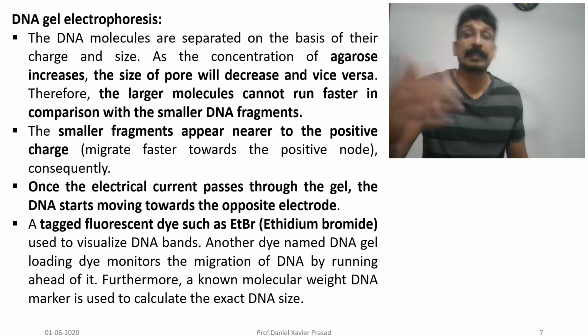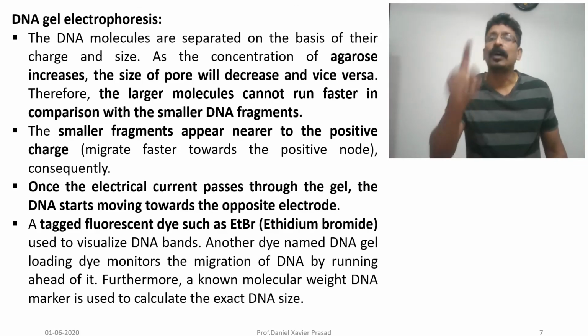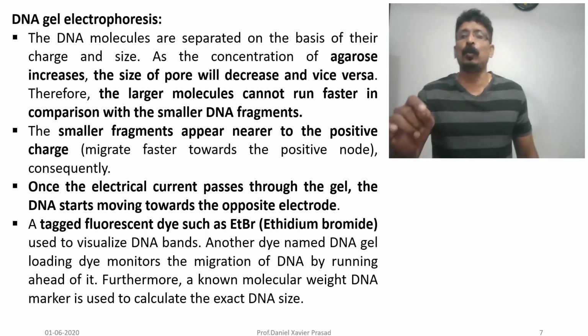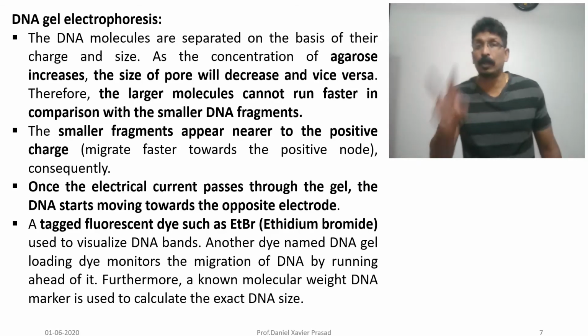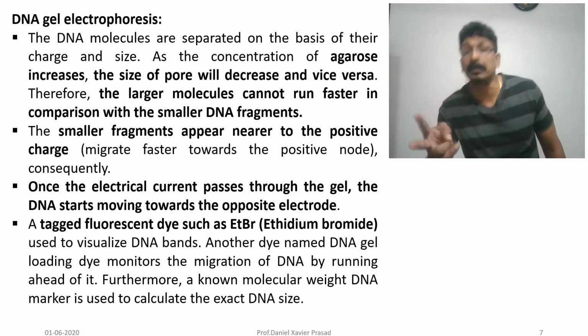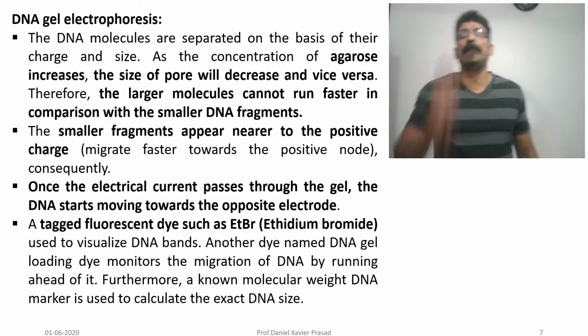But in my video, I have shown the electrophoresis, how two DNA samples are compared, whether they are similar or there is any difference, and whether they belong to the same or not can be identified. That's what I have taken.